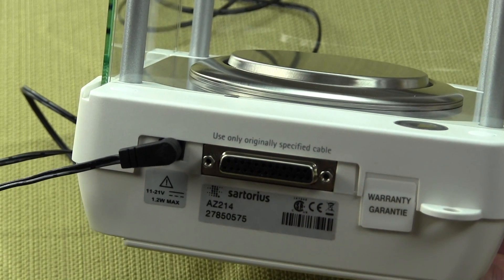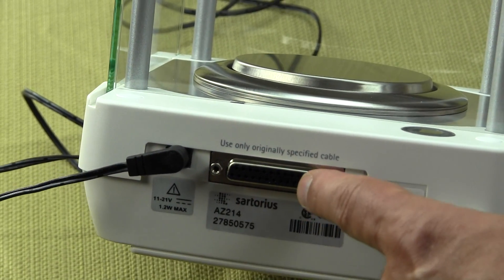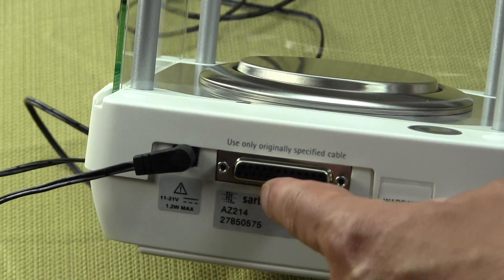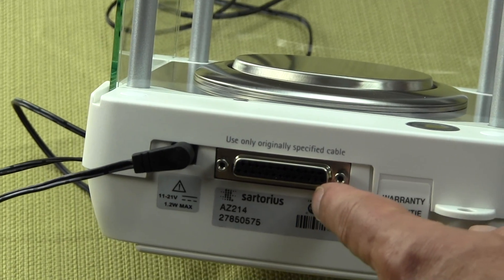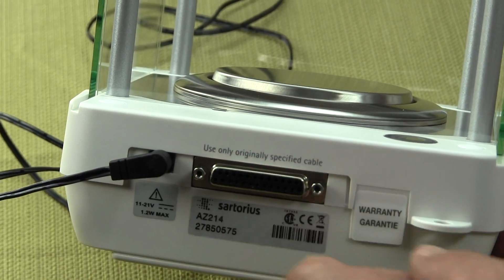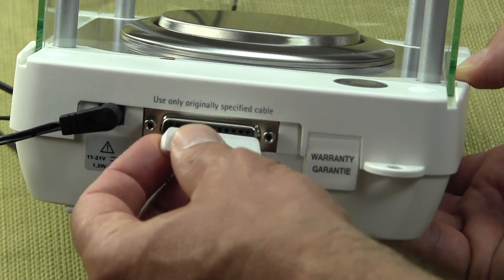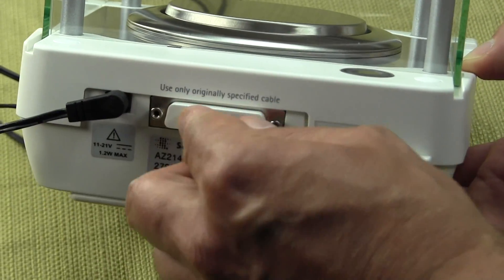If you do want to tie this to a computer, it is not a standard serial cable. You have to buy Sartorius' RS-232 cable. If it's going to a printer, if you purchase a Sartorius optional printer, the YDP-20 OCE, that comes with a printer cable.